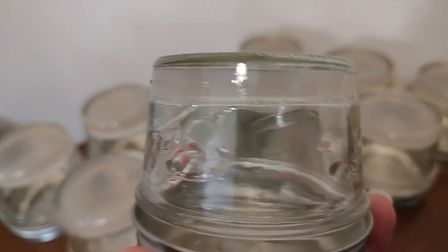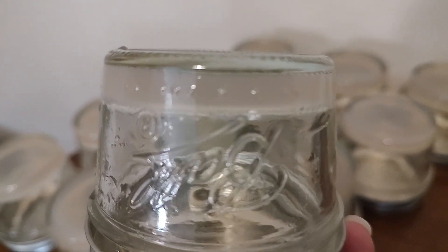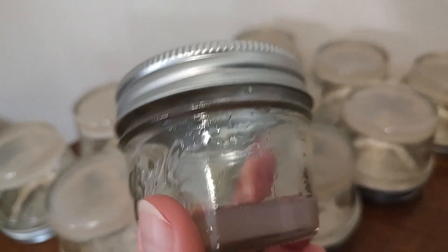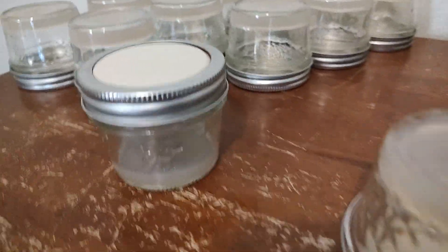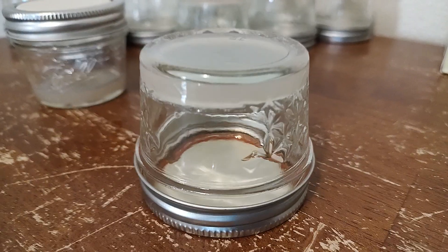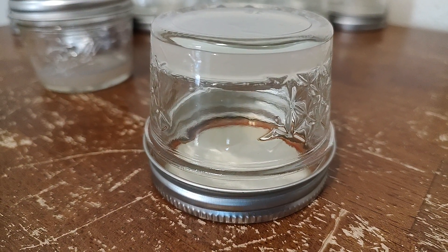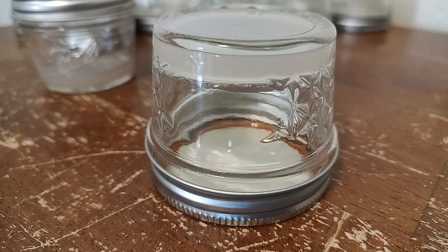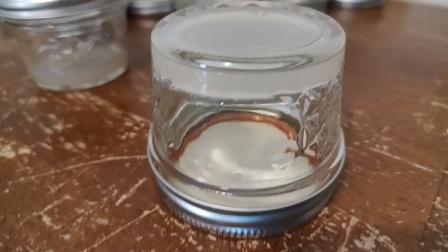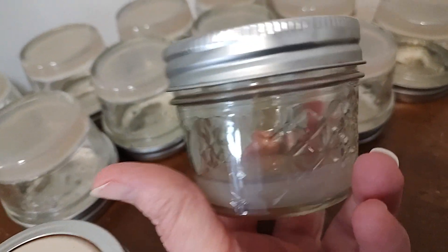We have those videos for you, and then he's going to make our super rhizomorphic MYA recipe with the nutritional yeast — just a pinch — and we're going to see if we get some different results. Stay tuned! We might just start skipping the water agar and go straight to this light MEA because it might be a little bit faster and we don't really deal with contamination. Moshla friends!